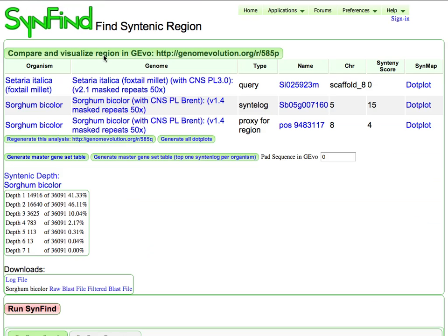And what happens behind the scenes is these two genomes are compared. This has already been run, so those large analyses have been cached.